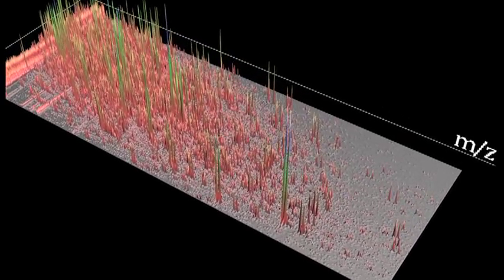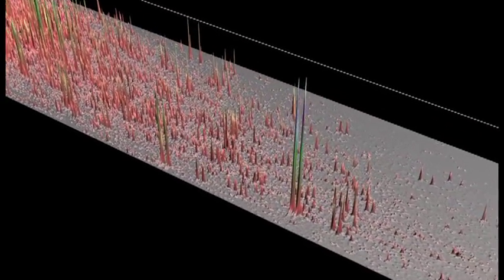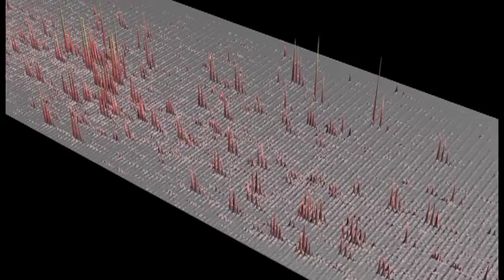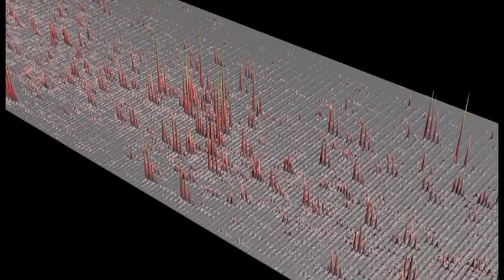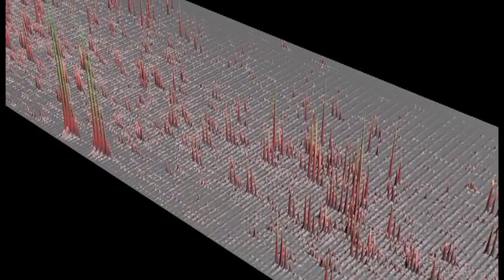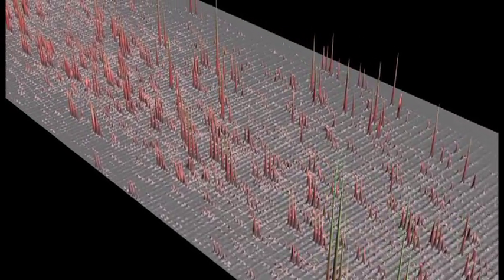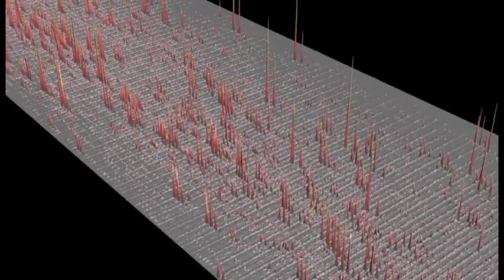You asked us to deliver the ultimate in system performance. That's why we design UPLC and high-resolution time of flight. These weave together with data-independent MS to E to generate fragment ions from all molecular ions.